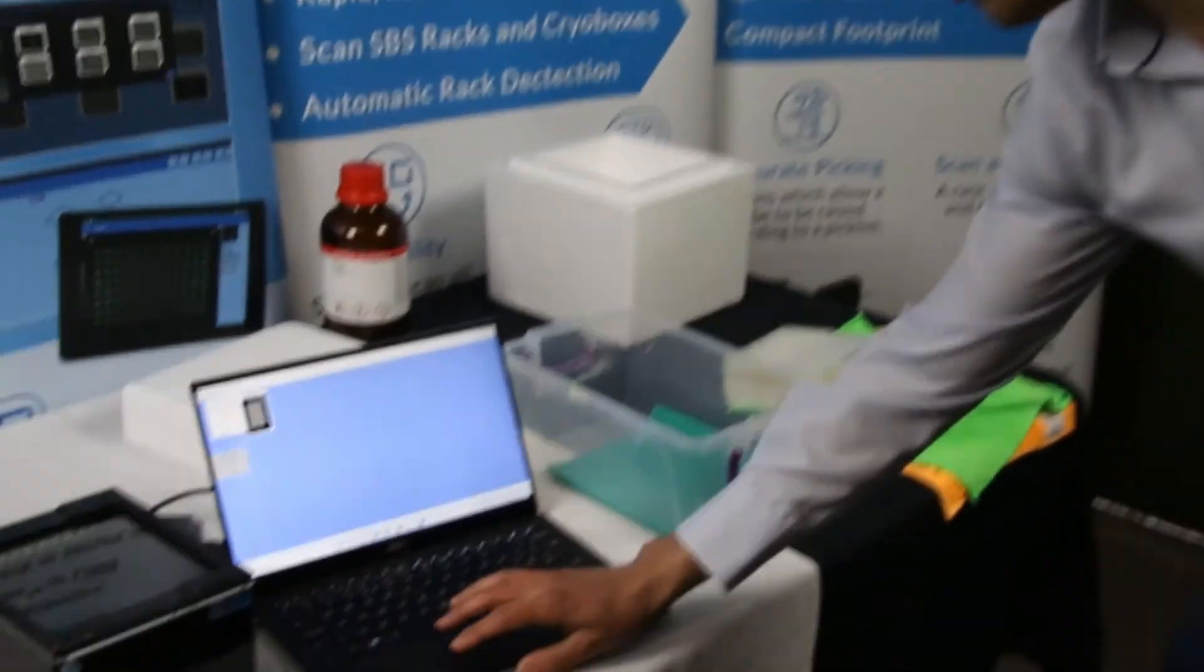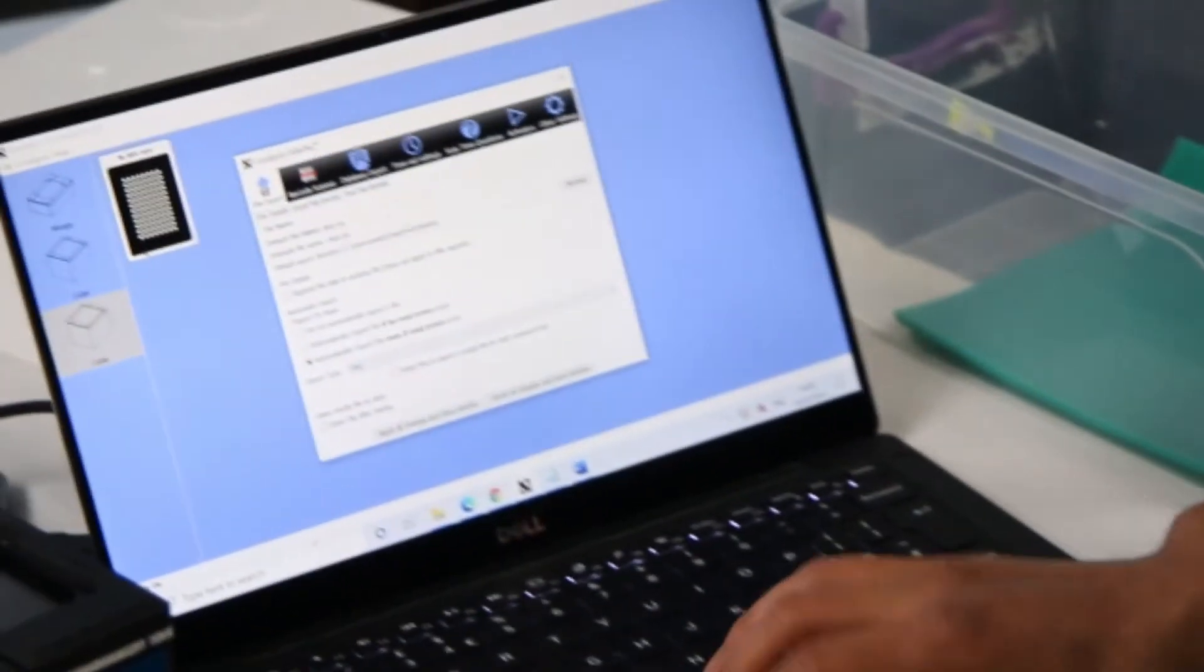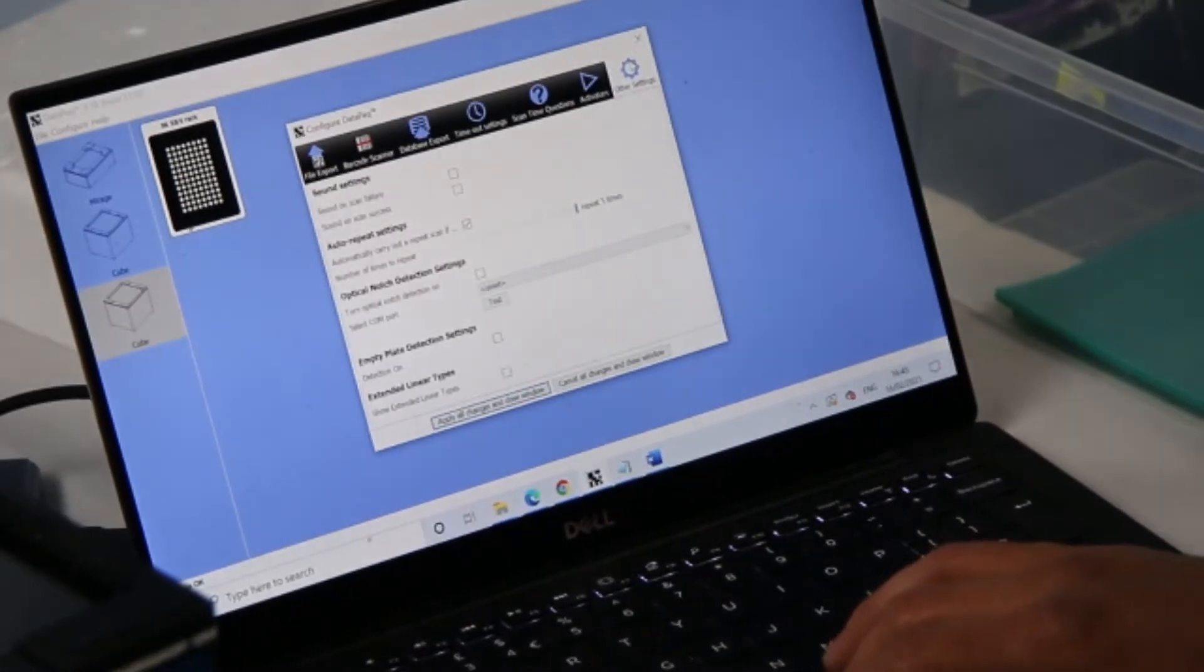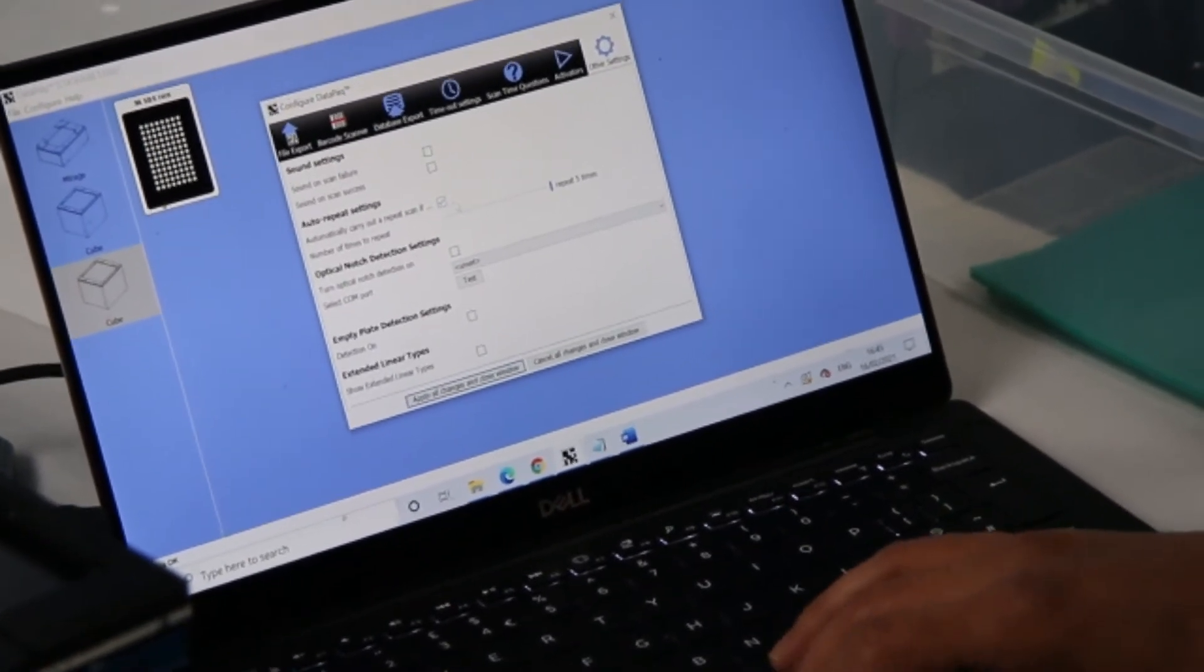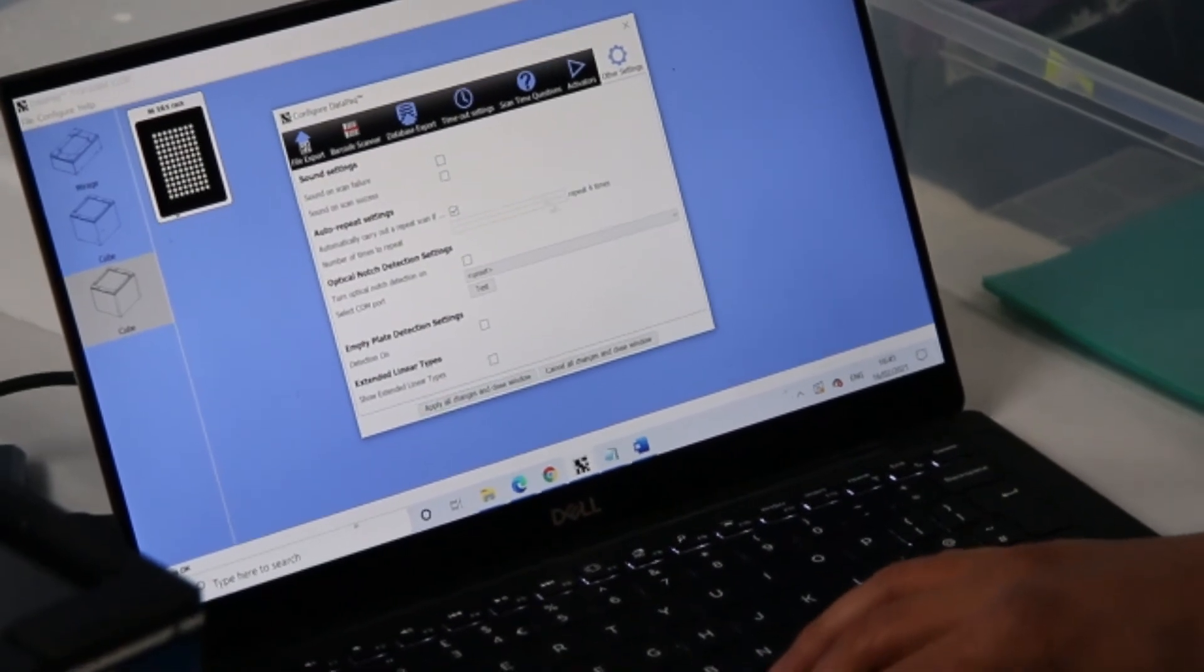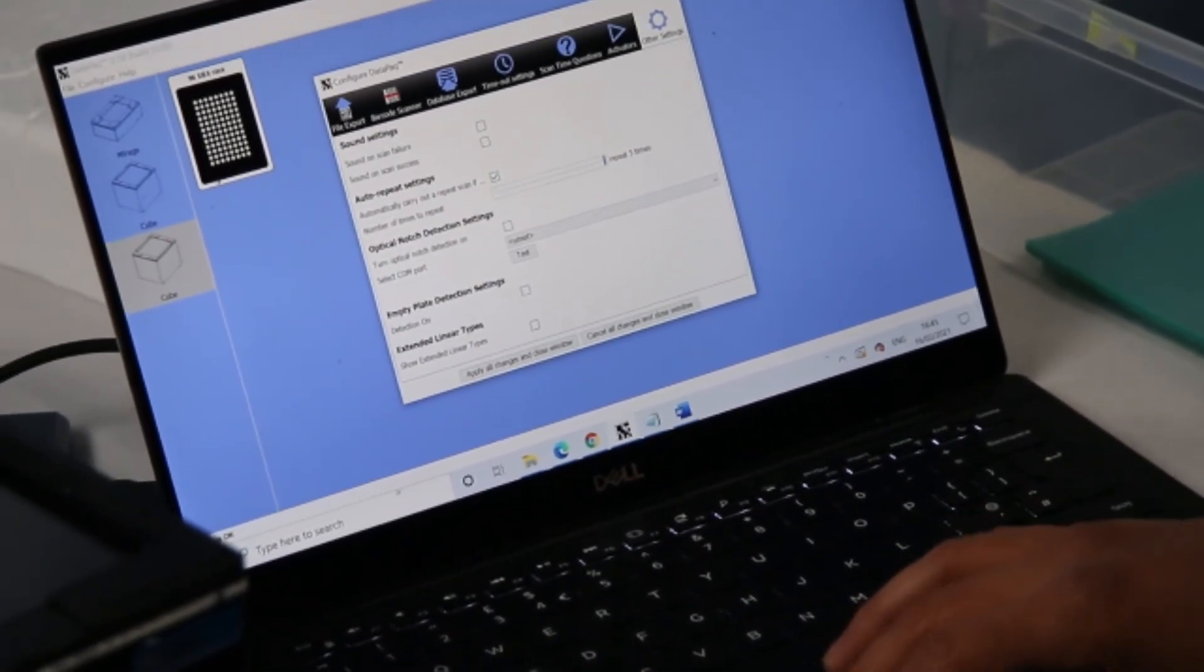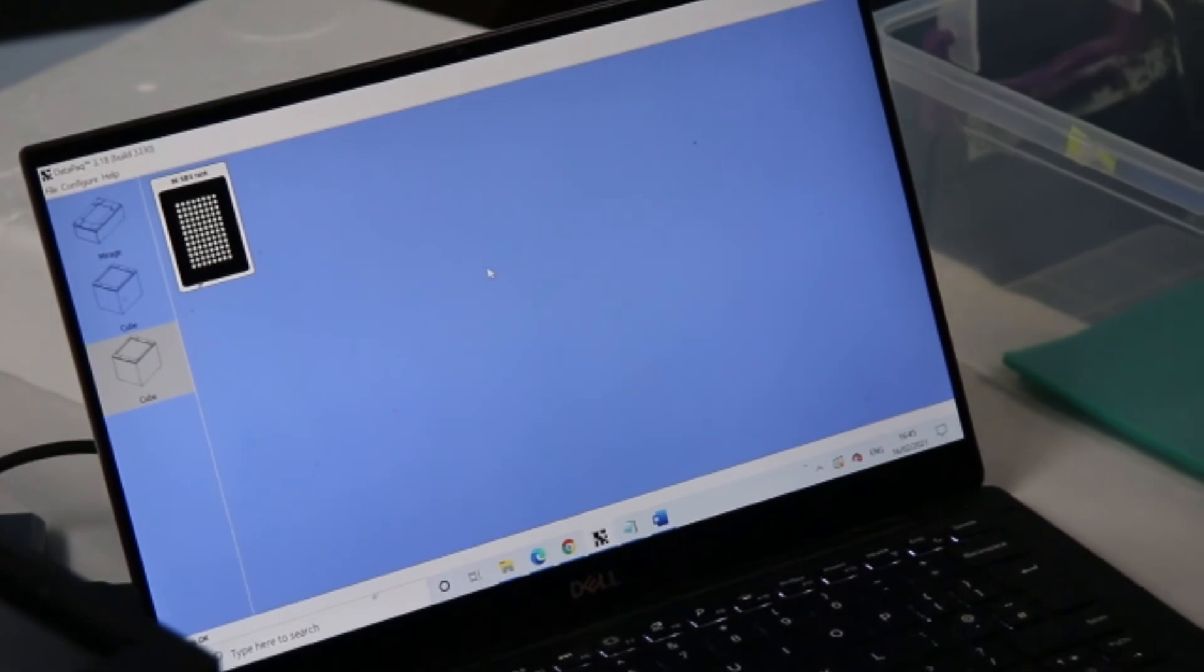For more difficult racks, turn on the repeat scan setting in the data pack options by going to configure, options, other settings and selecting the function that says automatically carry out repeat scan if and setting it to maximum repeat five times. Apply all the changes to confirm the options.